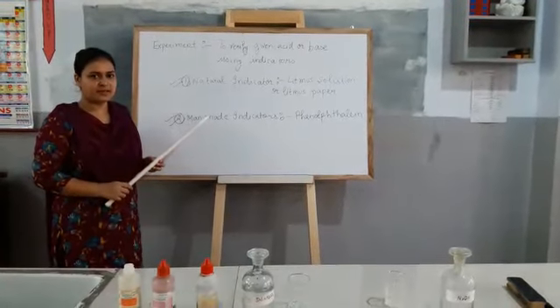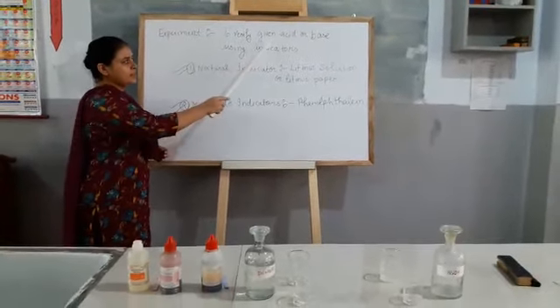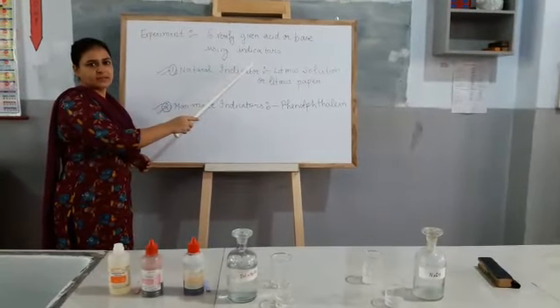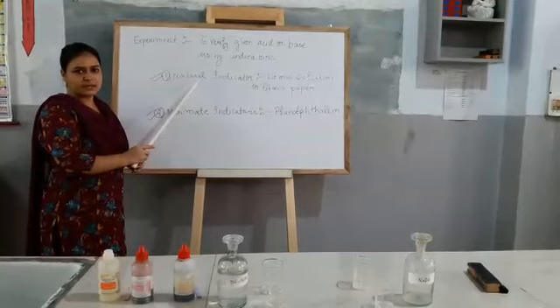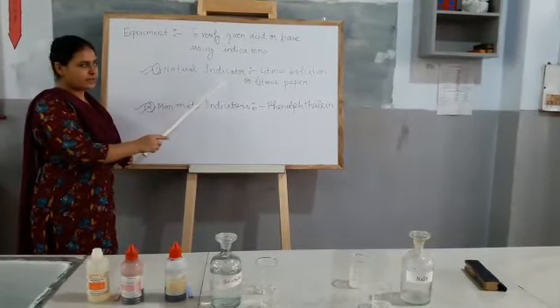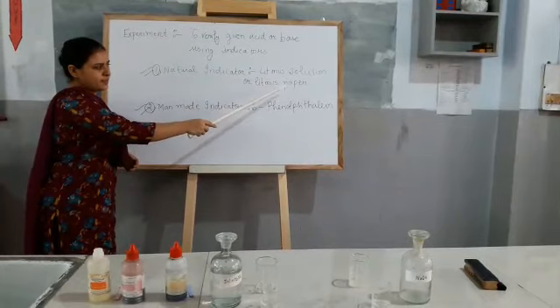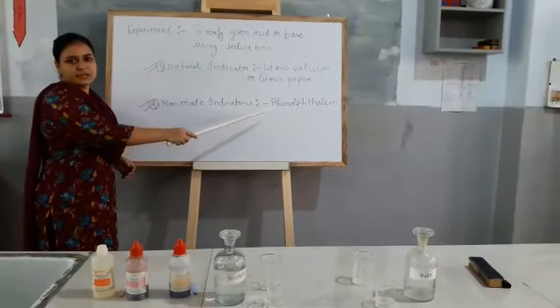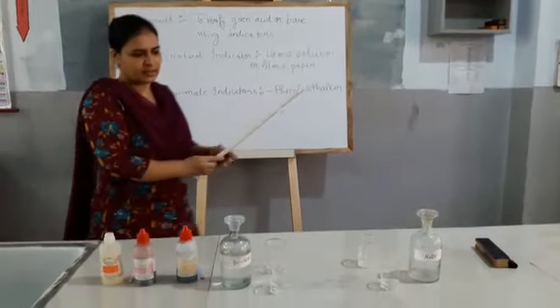Today we are doing an experiment for class 7 to verify a given acid or base using indicators. We are using two indicators: one is a natural indicator, where I am using litmus solution or litmus paper, and in the man-made indicator, I am using phenolphthalein. Now let us do our activity.